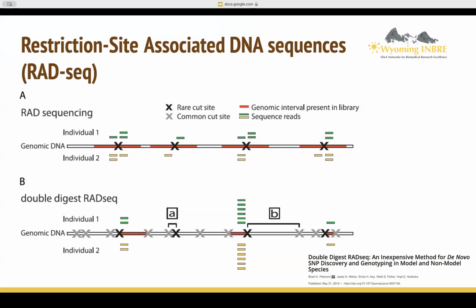So the main difference: traditional RADseq typically uses a single enzyme and relies on mechanical shearing to produce fragments. In contrast, ddRAD uses two enzymes and size selection to consistently target the same genomic regions across samples. This leads to better consistency and reduced genome complexity.